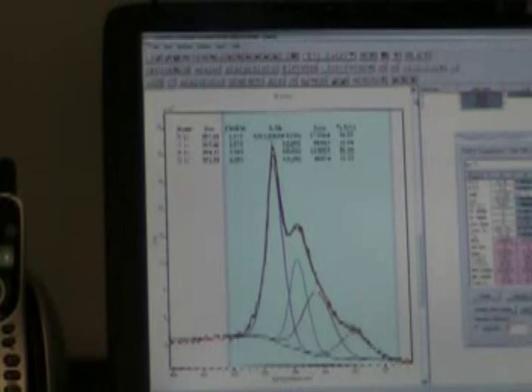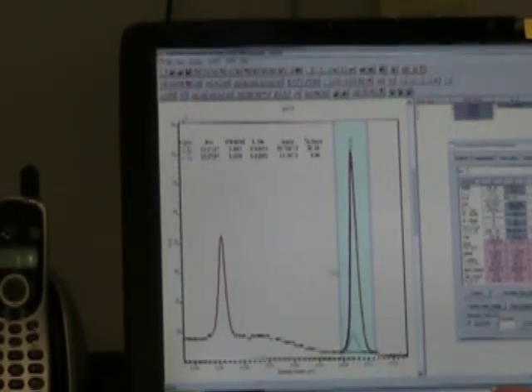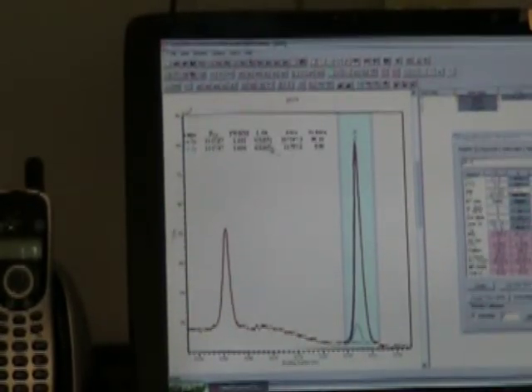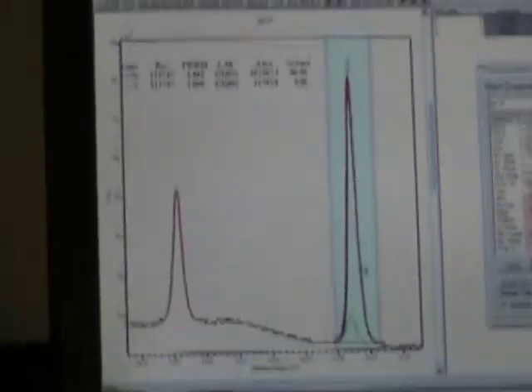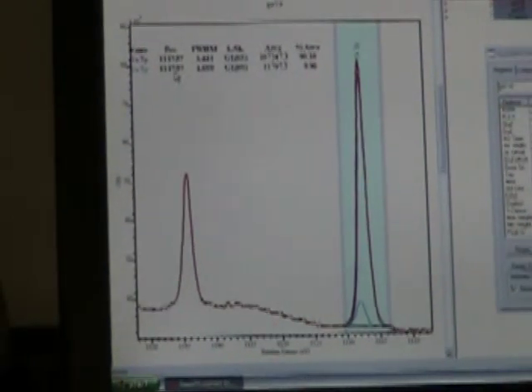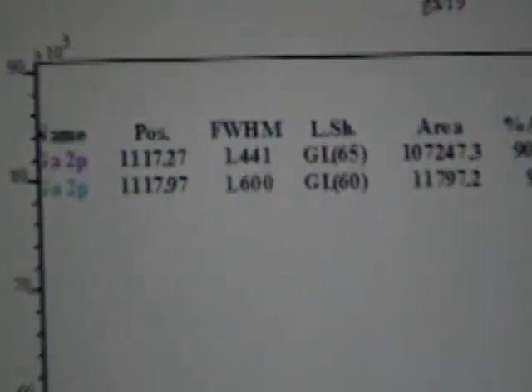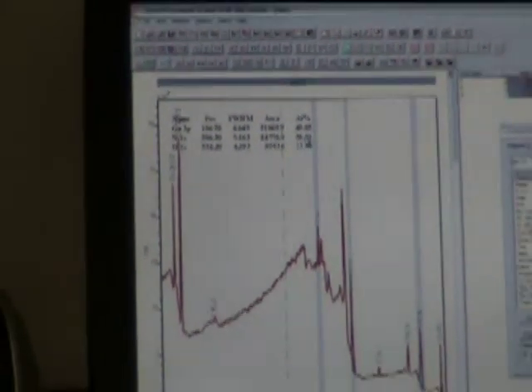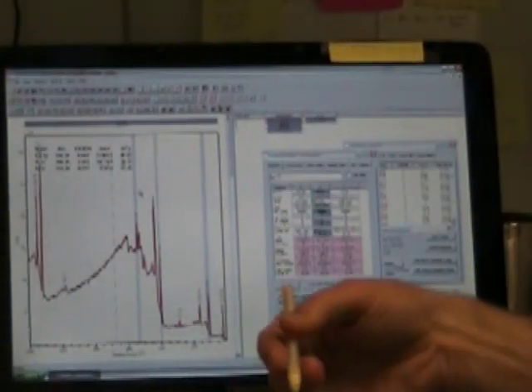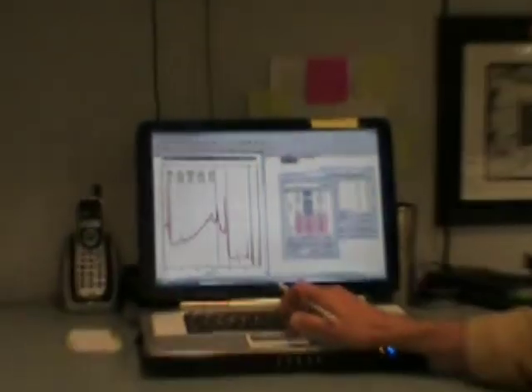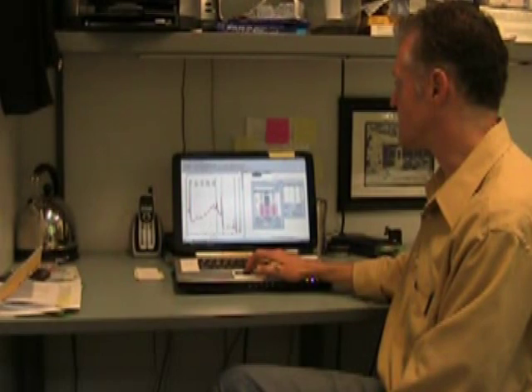If you look at, for example, at the gallium peak, this is our gallium high-resolution peak, and it shows that 90% of it looks as though it's in a bonding state with nitrogen, and about 10% is shifted a little bit upfield up to 1118 eV that looks more like an oxide. So again, going back to our survey scan, about 10% of 40 is four atoms. So, and that's what we're missing. That's the deficit that we have in nitrogen.